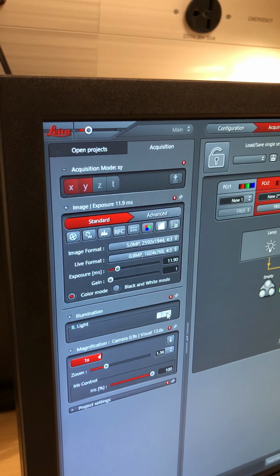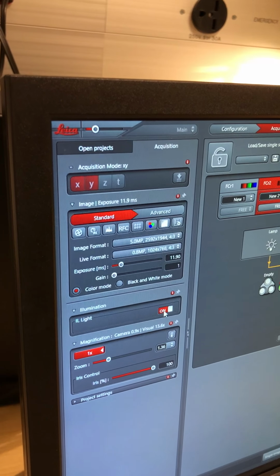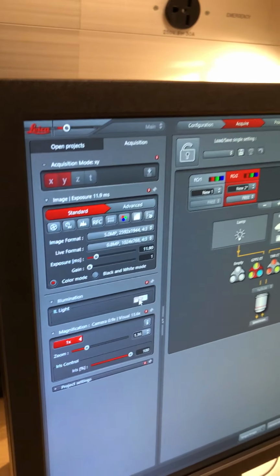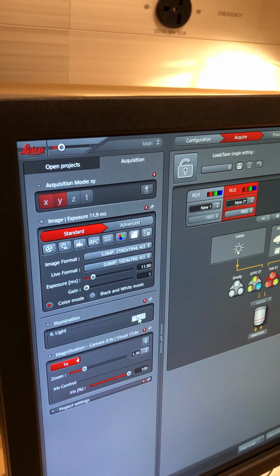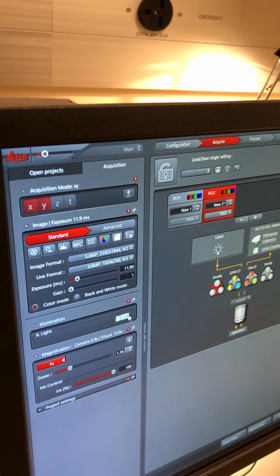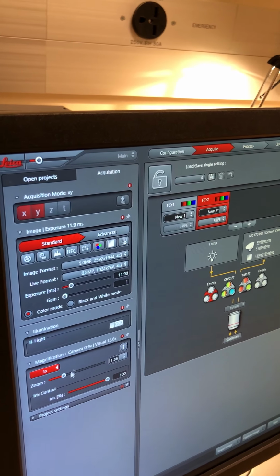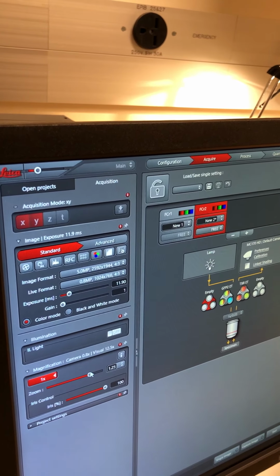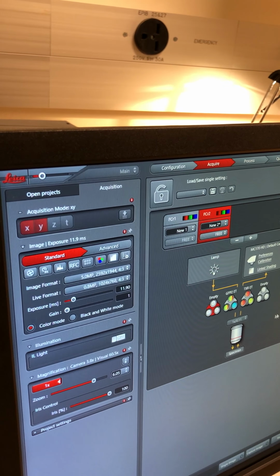I don't know if yours is coded. So that's the filter for the fluorescence light. The Z controls the Z. Is there an automatic control of the zoom on this computer? Yes, so the zoom is right there. It's motorized. It'll take it a second to catch up.